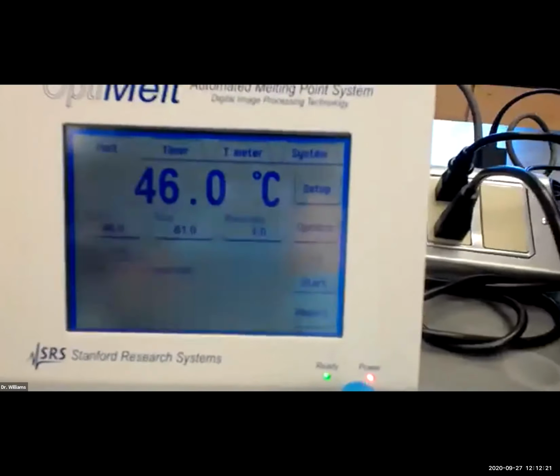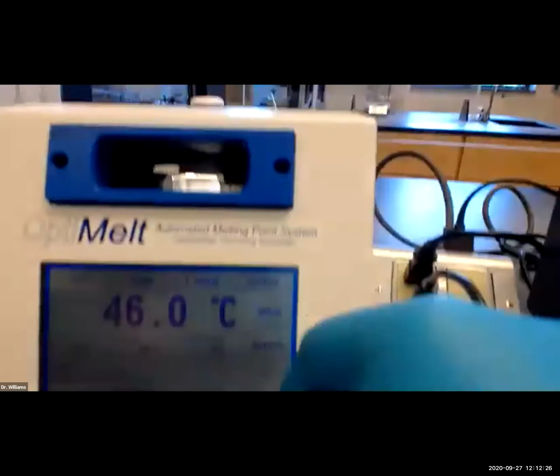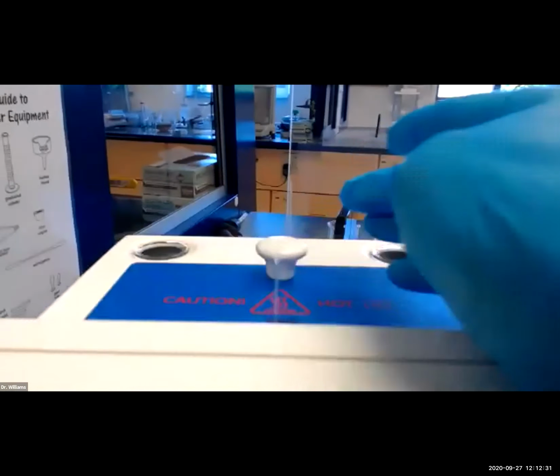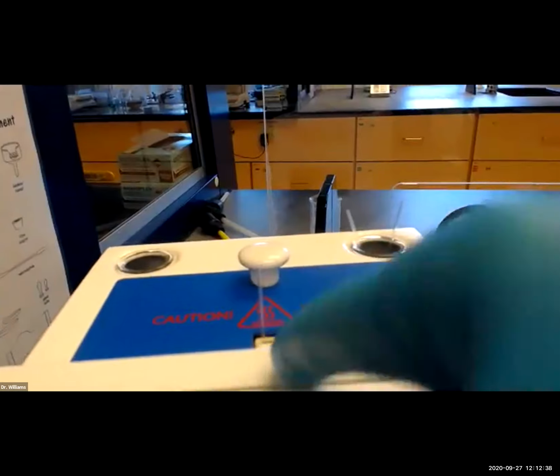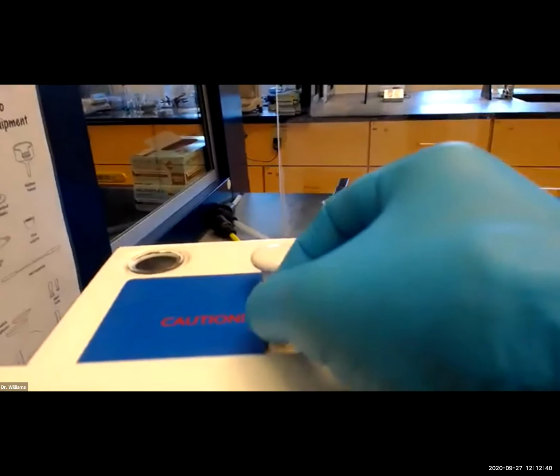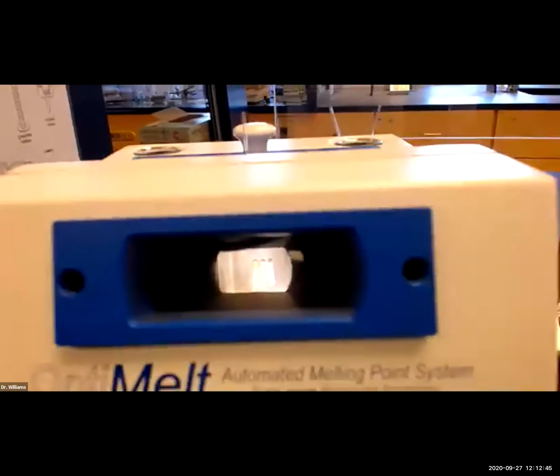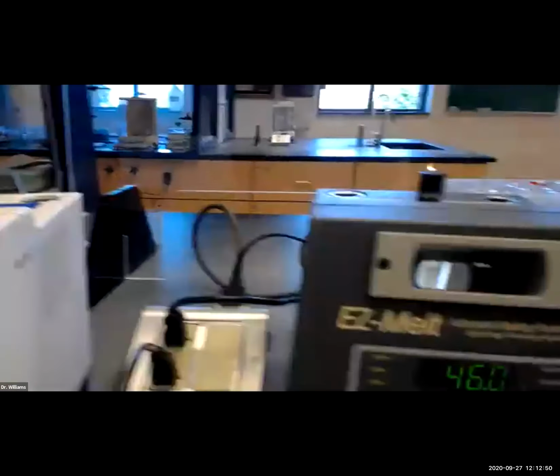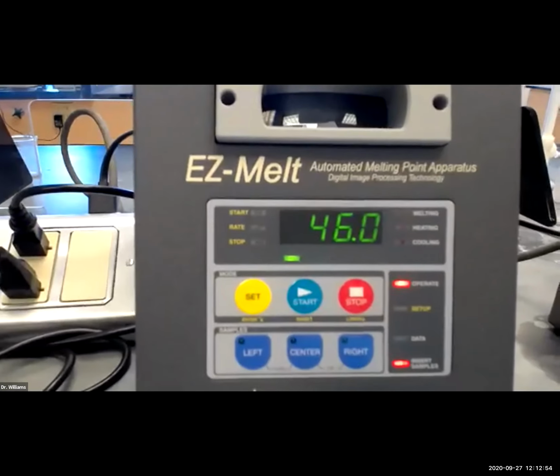Over here, you see the ready button is on, and we're ready to start, but I don't want to start until I put my sample in. Now that's not in. If you look in the window, you won't see the sample. Because this is a little bit newer instrument, there's some snugness there with me. So just push it down gently. Now we're cooking. Now we can see the sample in there. All right. Looking good. So over here, the sample's inserted. We'll press the start.